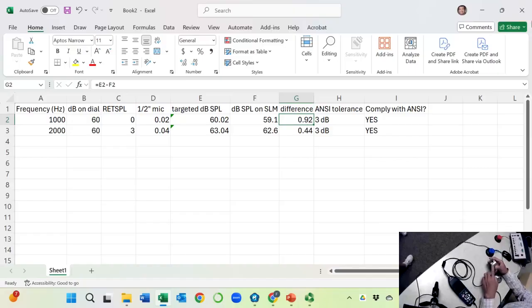And here is where you insert the preamplifier. Let me get the preamplifier out. Here is the preamplifier. Let me do it very gently because the thread is very small and fine. One trick is to do it in reverse, and then you will kind of click and sit in, and then you can do it normally.